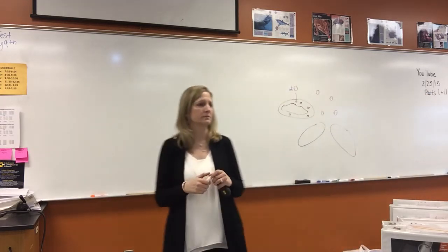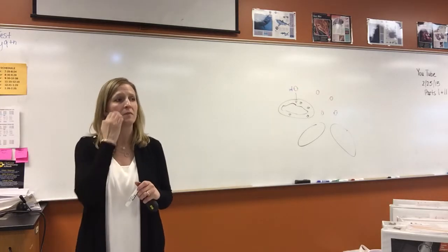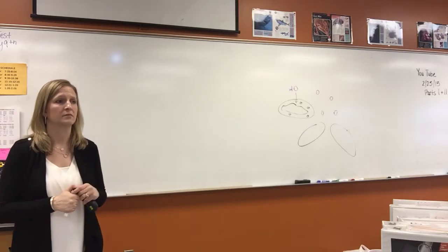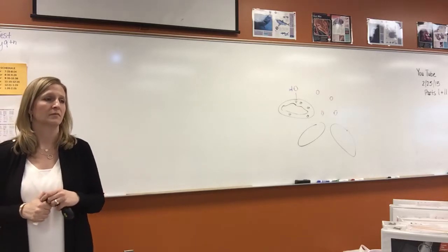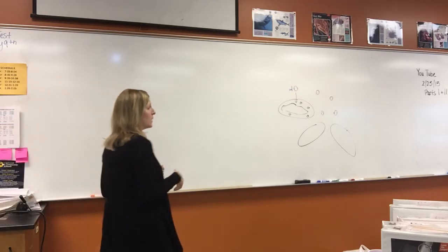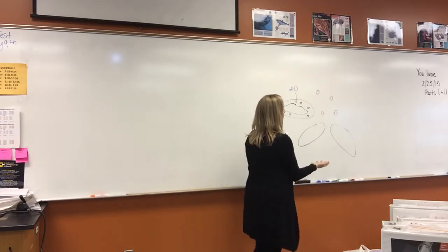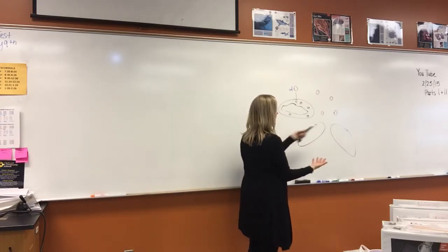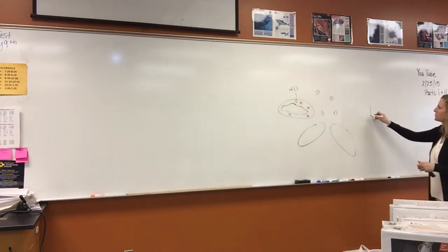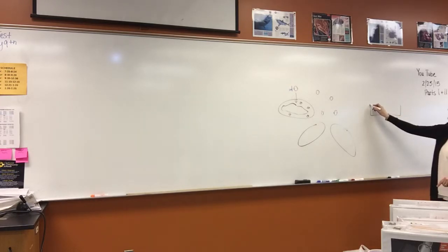If you culture bacterial colonies in ampicillin, that would kill off any bacteria that didn't take any plasmids that contain the ampicillin resistance gene. Yeah, absolutely. So in our lab, when we have a solution with this bacteria and we give it time to take in the plasmid, you're going to grow them because you can't see the bacteria in a clear solution like this. You can't see it, and so you know that there's some bacteria in there.